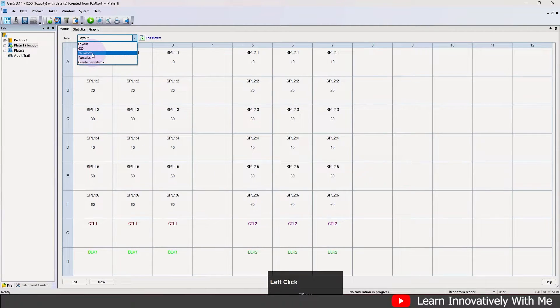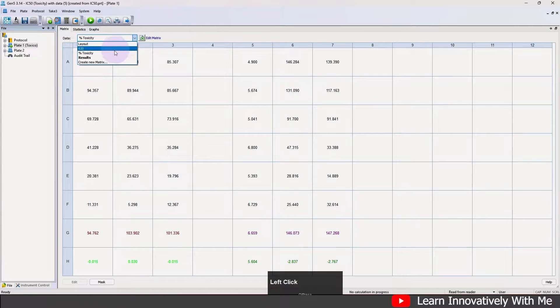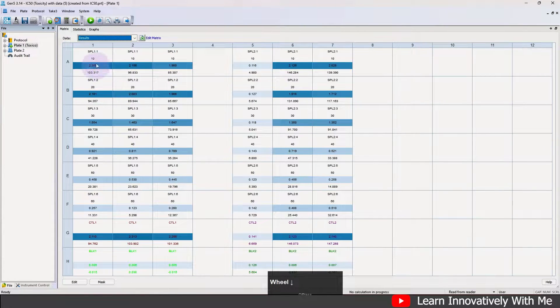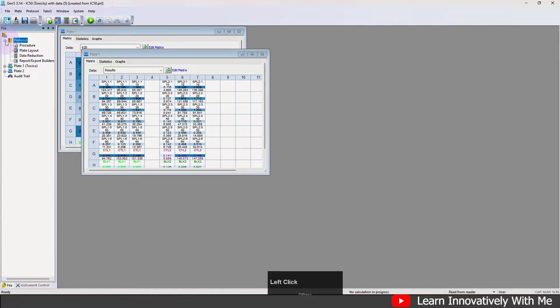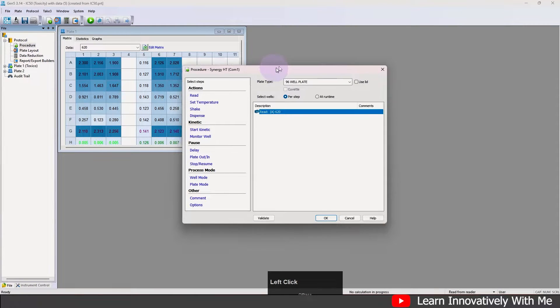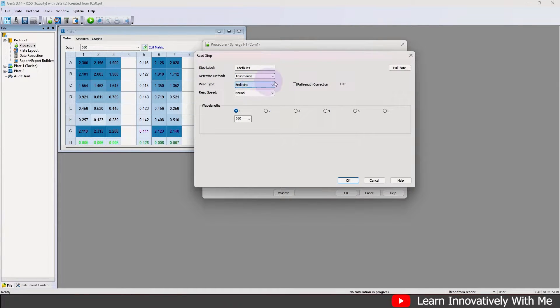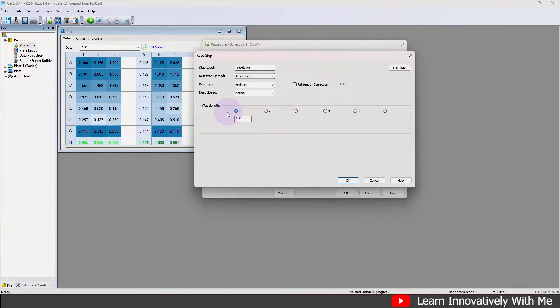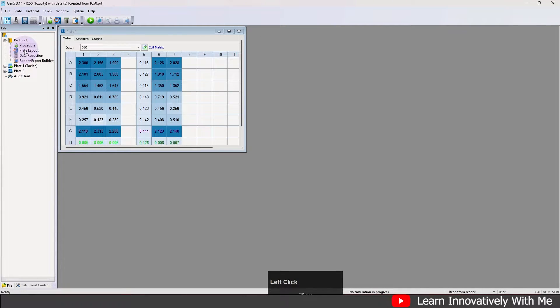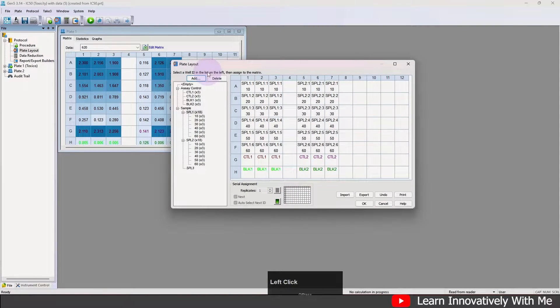You can check the percent toxicity by selecting here, and you can also check the result. To use this information for your experiment, click the plus button and click on the procedure. For this particular experiment, they have used absorbance endpoint, speed normal, and wavelength 620 nanometers. You can change this according to your drug and required wavelength, and also add more wavelengths if you have a reference wavelength.